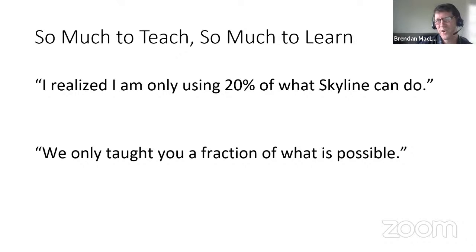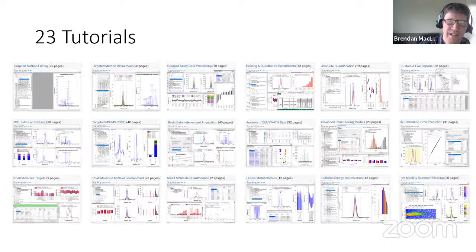And Skyline has grown, this is probably 6 years ago. Skyline has grown quite a lot. So there's even more stuff that you might not do, but just like Excel, which has been going for, I don't know, 30 years, 40 years, you can learn a small amount, become effective, and expand from there. And maybe you never do. I certainly don't feel like I use all of the functionality of Excel, but it's extremely useful to me.